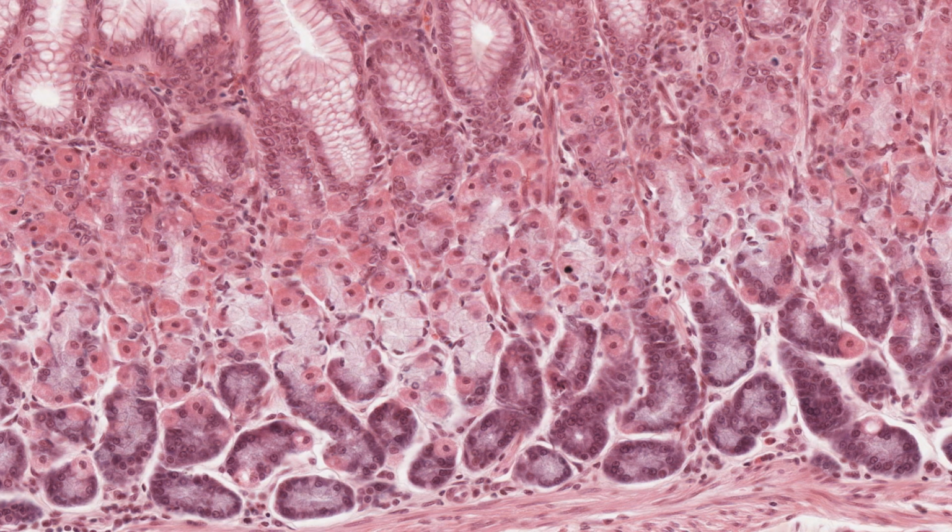Down further into the tissue, you see a population of pink stained cells and a population of bluish stained cells, with a few pale stained cells in the middle. They're cells that are exhibiting acidophilia and basophilia respectively, staining with eosin or hematoxylin.